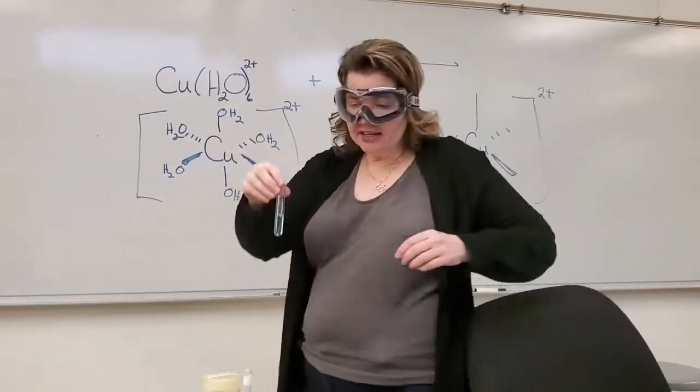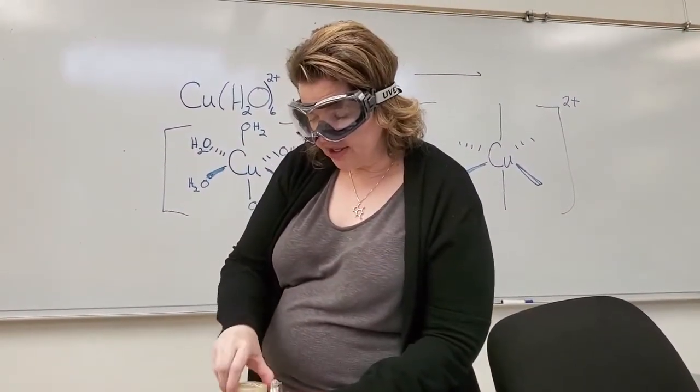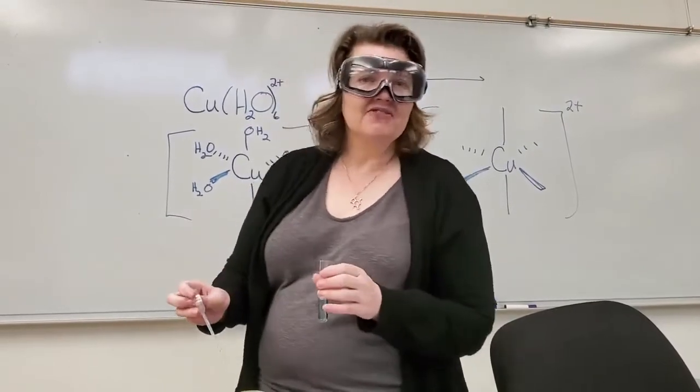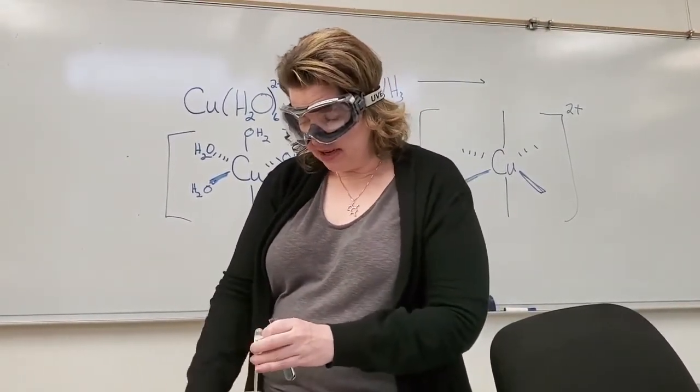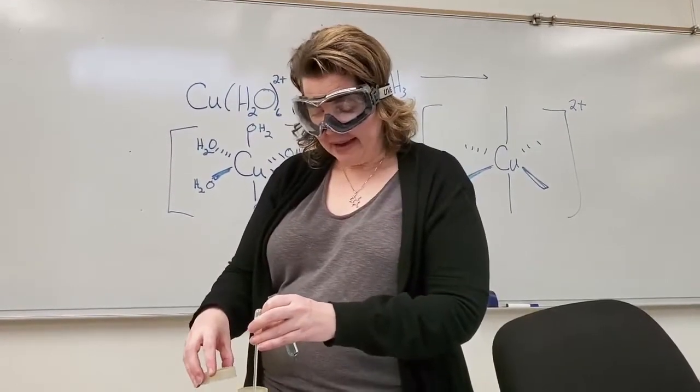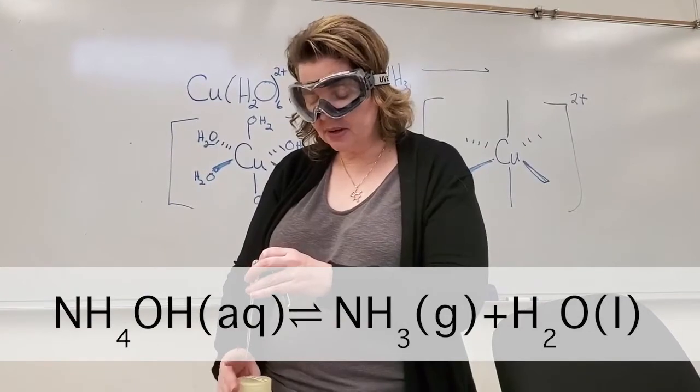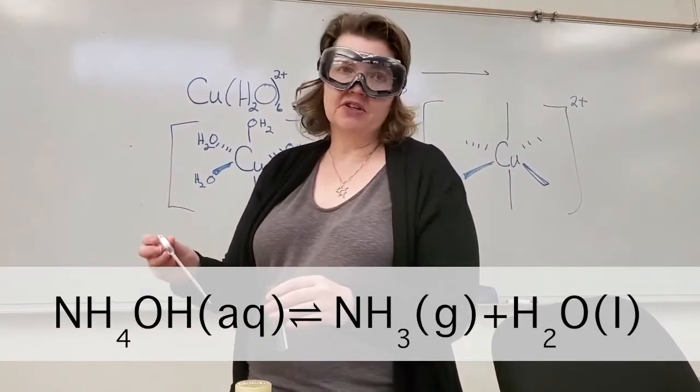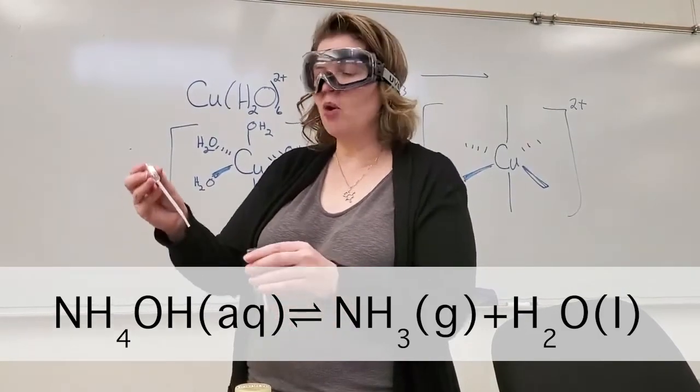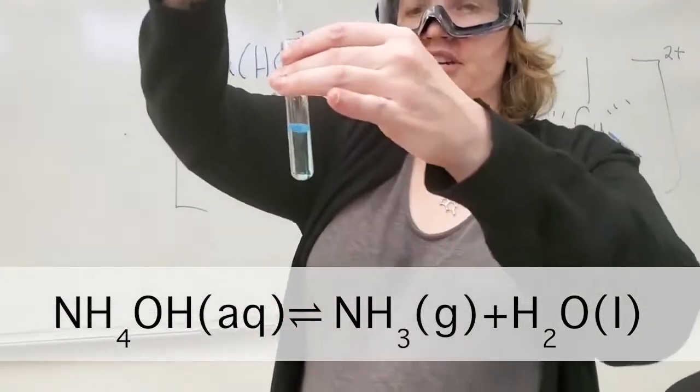We're going to add a little bit of ammonia. Your lab procedure talks about the concentration of ammonia being one molar, but I have a confession to make. We are here making this video, and our ammonium solution went bad. Ammonium hydroxide decomposes into ammonia plus water very readily, so it's very difficult to control the concentration. This says six molar on the bottle, but I honestly don't know what the concentration is.